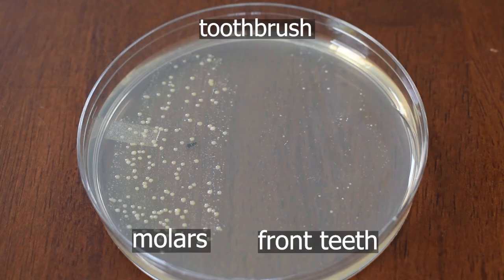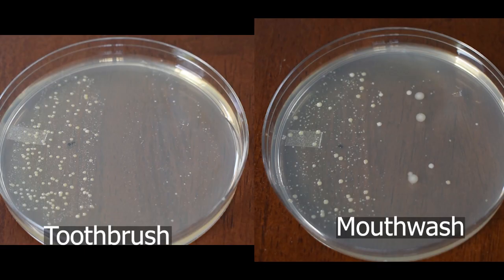Next is the toothbrush. This plate had less bacteria density from my molars, and a significant drop in bacteria from my front teeth, which means I probably brushed my front teeth more than my back teeth. Here's a comparison with mouthwash.